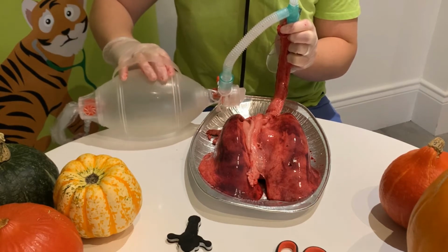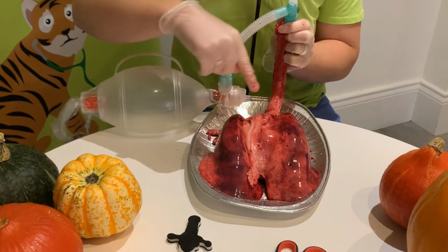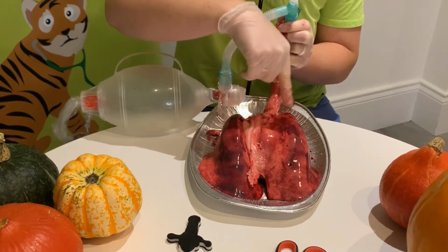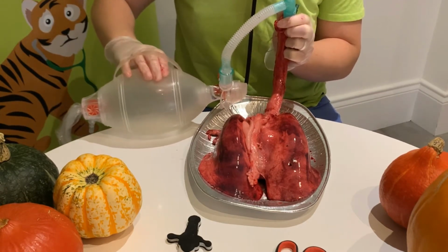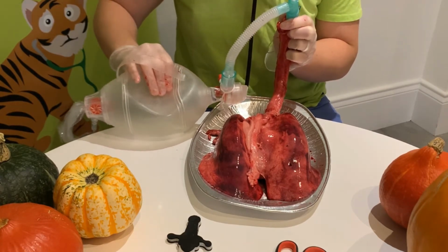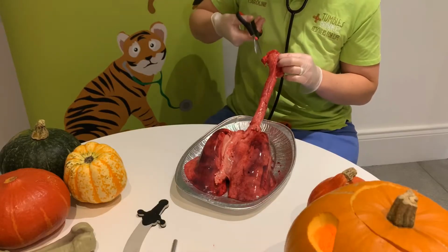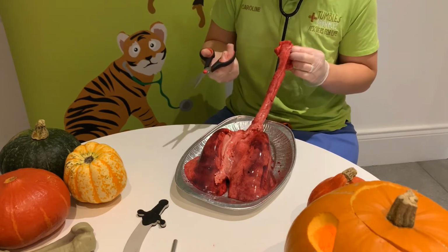Now that happens in both of our lungs, but today it's only happening in this lung because this one has been cut, okay? And it's to show you that if there's a problem with the lungs, if air can't get down into that lung, then it won't blow up, okay? And it won't inflate. So we've got today one really strong lung that works. But most people, most of the time, have got two lungs that fill up with air that help the oxygen get around our body. What we're going to do now is we're going to cut down the windpipe, down the breathing tube, and we're going to see where it goes, okay?